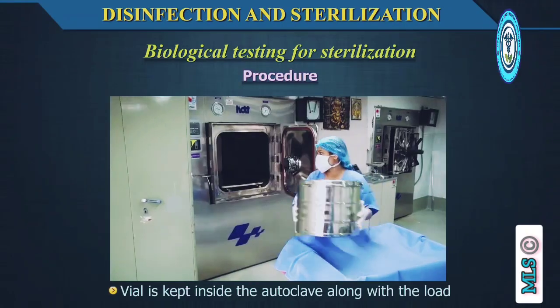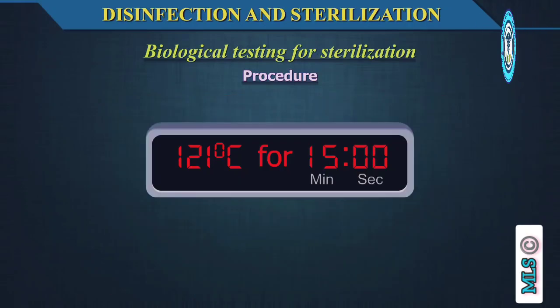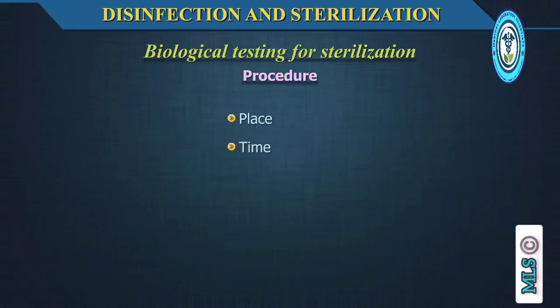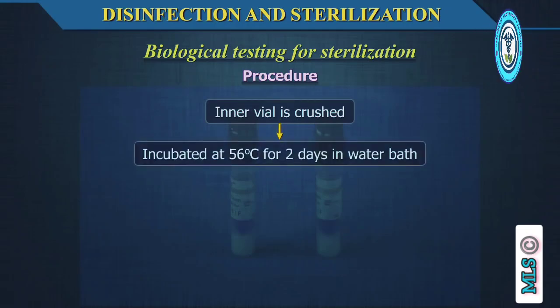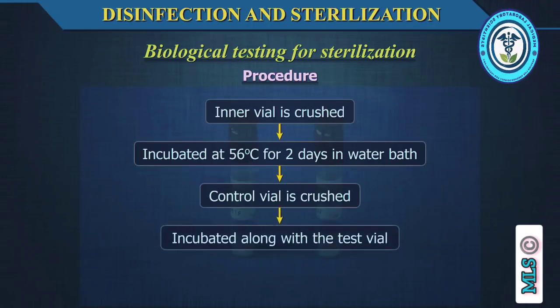Procedure: the vial is kept inside the autoclave along with the load. After completion of the sterilization cycle, that is at 121 degrees Celsius for 15 minutes, the vial is brought to the microbiology laboratory along with a filled form, which includes information about the place, time, holding period, and type of load. The inner vial is crushed with the help of a hard object and incubated at 56 degrees Celsius for 2 days in a water bath. A control vial is also crushed and incubated along with the test vial.